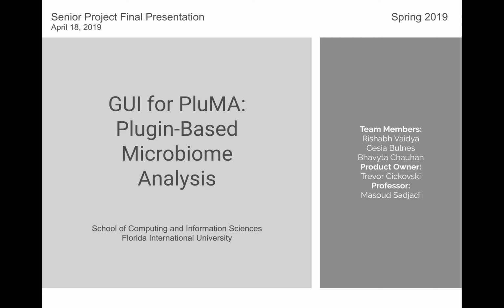We worked on the GUI for Pluma, which is a plugin-based microbiome analysis software. This was developed at Florida International University under our product owner Trevor Cickovski and our professor Masoud Sadjadi. My name is Cesia Bulnes and my team members are Rishab Vaidya and Bhavyta Chauhan.